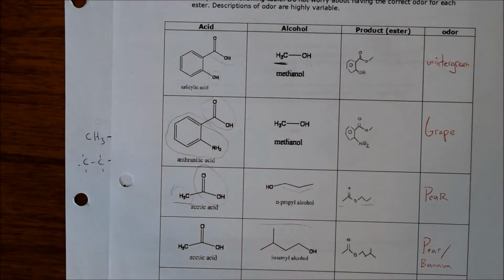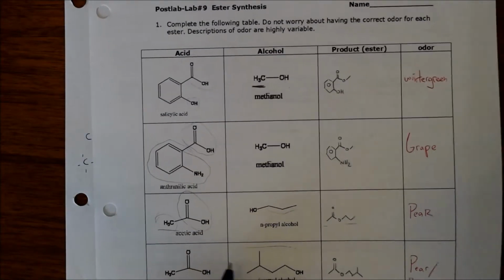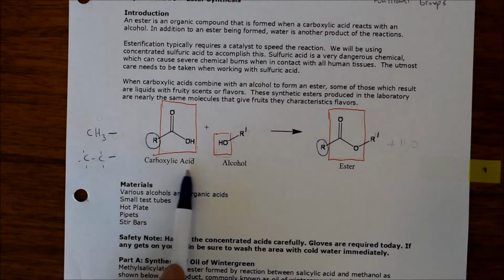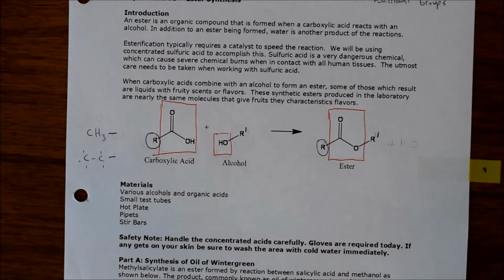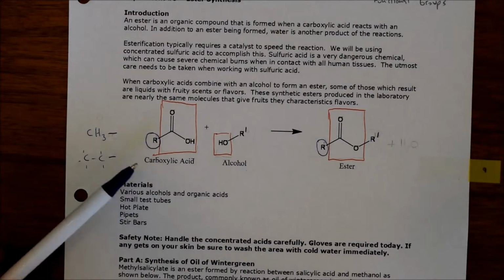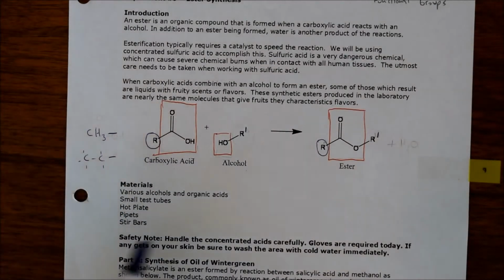you'll be using. And what's really cool about these is that even though it's the same base reaction, carboxylic acid interacting with an alcohol to produce an ester containing compound, these all have really unique smells. And in the process of the lab, part of the thing that you'll have to do is figure out what smells are associated with what compounds. And it's pretty surprising that just a small functional group with some of the differences that you'll experience will have completely different smells. Some will smell like one fruit, and the others will smell like a different one. So what's really cool about this is that we have one base reaction, but if we change what atoms are in the compounds, then we can have completely different smells.